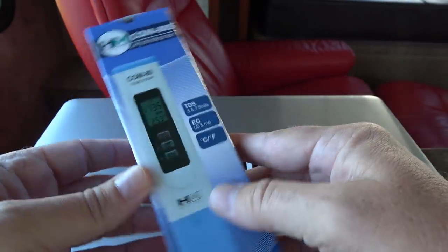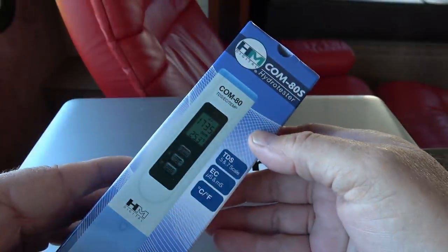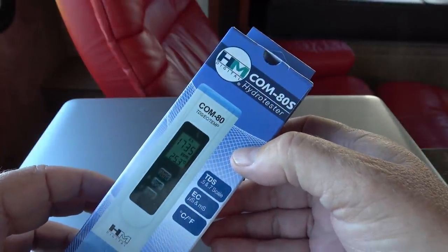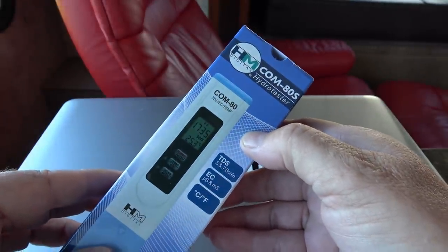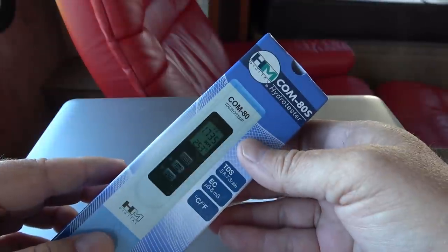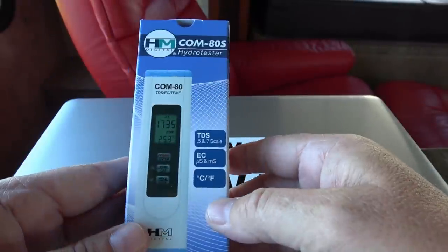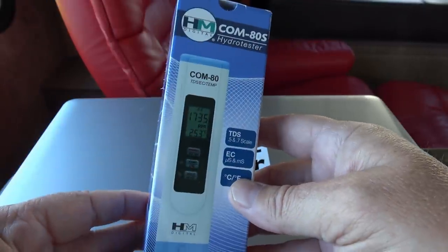What it's supposed to do is measure total dissolved solids in your water. All water has solids dissolved in it — even tap water is going to have minerals, and a lot of these minerals are actually healthy. If you get very purified water it can go down to very low total dissolved solids, and some filters will totally get rid of it. It's kind of healthy to have certain minerals in your water, but you don't want other types. If you get above a certain amount of parts per million it's supposed to be unhealthy, so I thought this would be a neat little gadget.